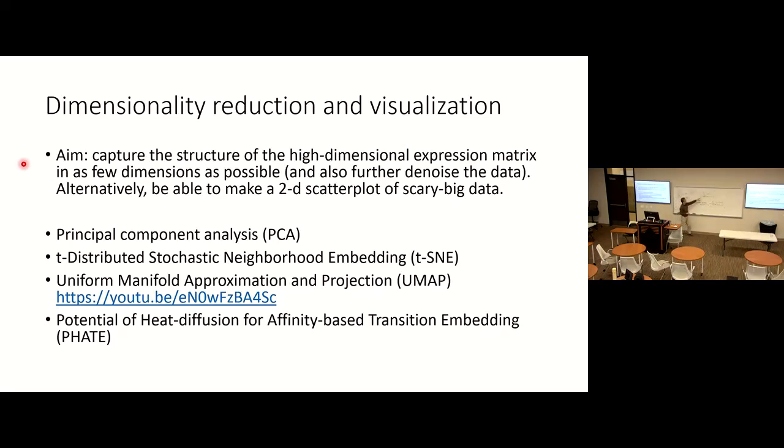So you can try different new axes. You can rotate 360 degrees, and every time you compute the new variation projected onto it, until you reach the largest, then you stop. That's PCA.